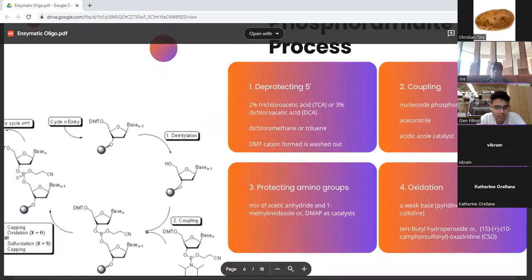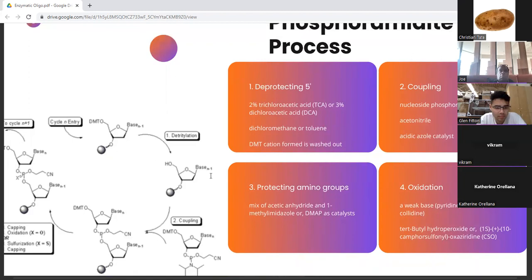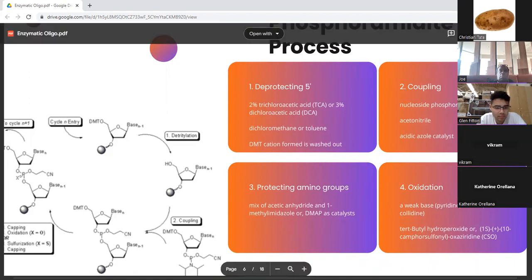And side note, I talked to some pretty good chemists, and they said that the 5' end is way more reactive than the 3' end. So as long as you don't add any extra, like in excess of your reactant, it'll exclusively go to the 5' end most of the time. And the 3' is more reactive than the 2', especially if it's deoxygenated already.